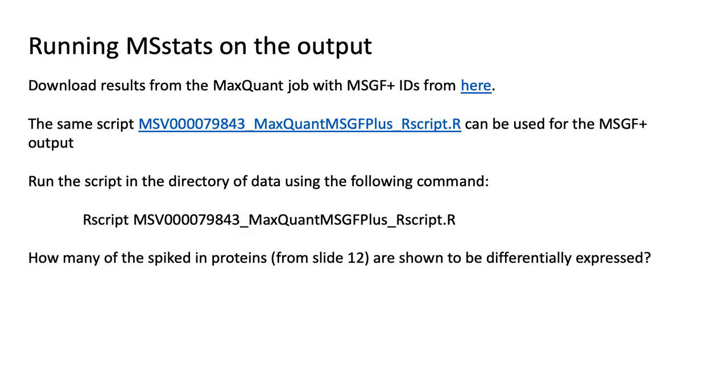Okay, does that make sense? So essentially, what it gives you is a generic MaxQuant workflow that can be used for integration of intensities for any identification. And then you can use that to run MSStats, and then you can use that to make a reanalysis that you can submit and share or compare with others that are already in the system.